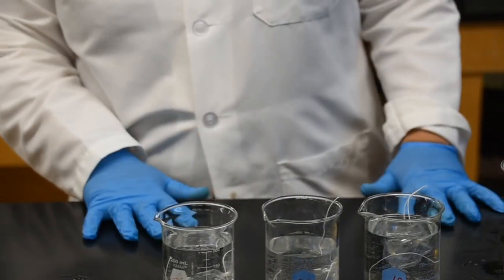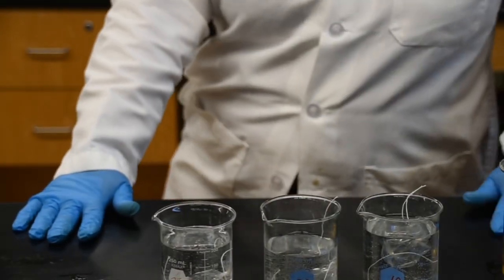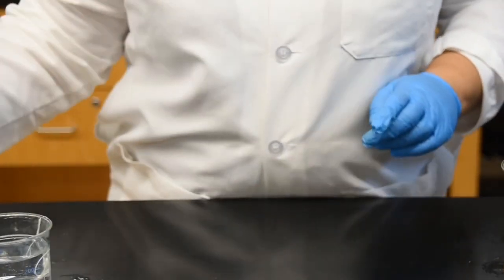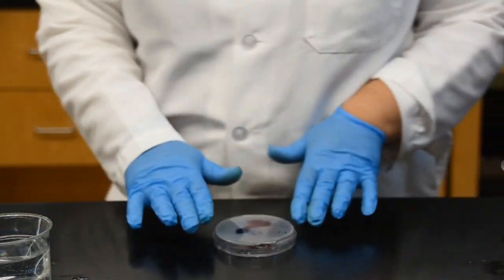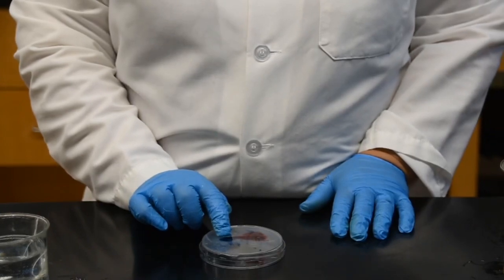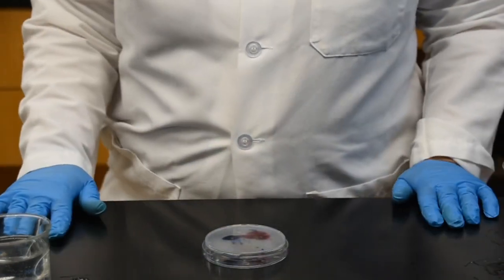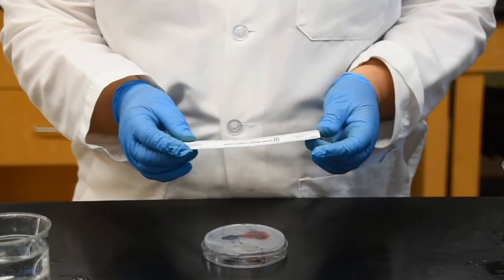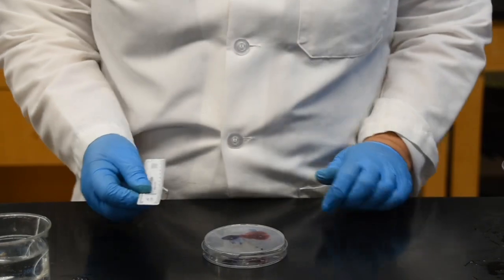Okay guys, so let's go ahead and take a look at our results for our three experiments. The first experiment we did earlier was on how the molecular weight affects the diffusion rate. So right here we have our two samples. We have the blue one, which is our methylene blue, and the red one is our potassium permanganate. I'm going to take a ruler and, using the centimeter side of it, measure the diameter that the stain has traveled.